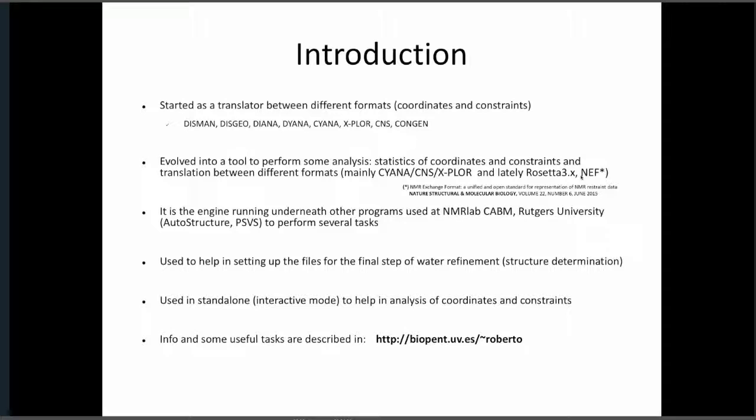It is not included in the version that is already on the web page, but it will be in the next version. It's already tested, and it may need some corrections by hand, but it will mainly do the job.